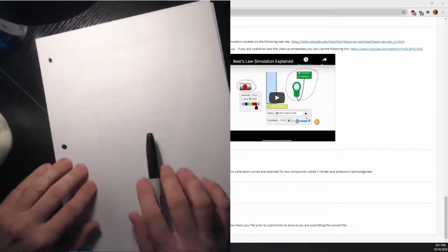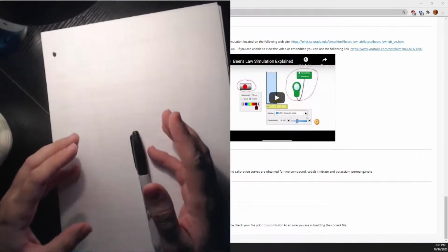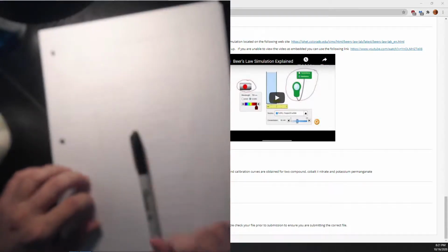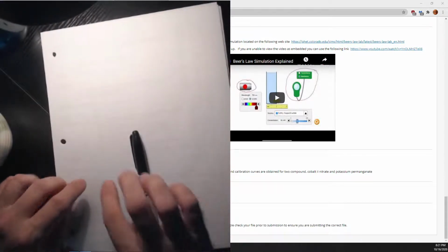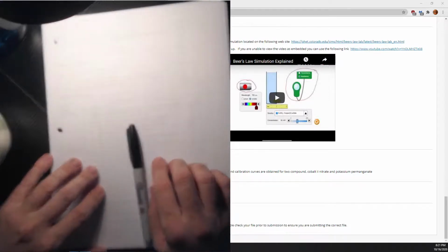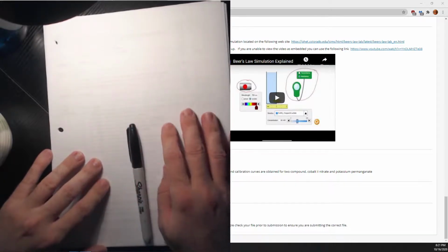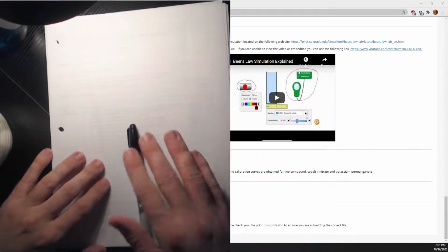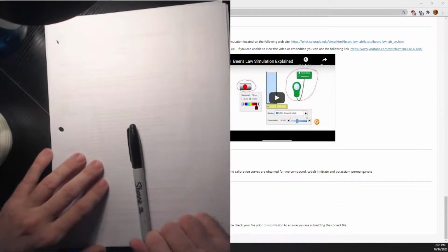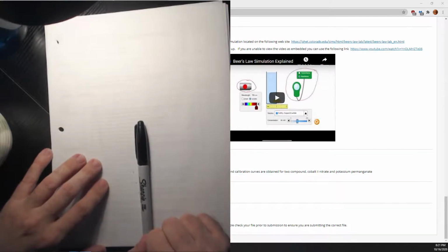That's like hitting the tare button on a scale. You don't want to measure the weight of the container that you're measuring your substance into. You just want to measure the weight of the substance. So you put the weigh paper or the weigh boat down, and you hit the 0/T button. You're doing the same thing with your blank. You have just the solvent by itself with no solute in it, and you measure the absorbance, and then you can calibrate for that, so that you automatically ignore that. You've got to remember to keep that in account.